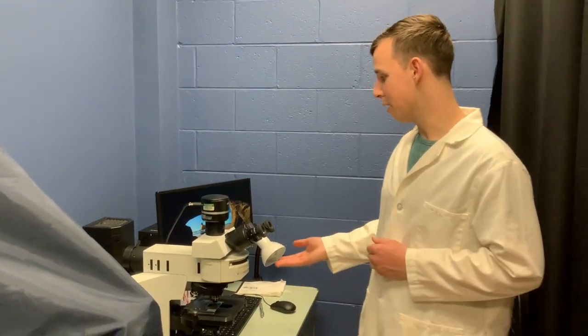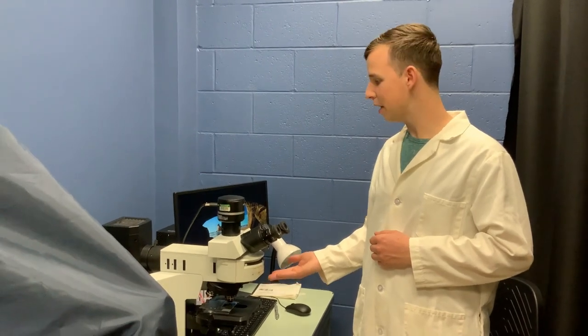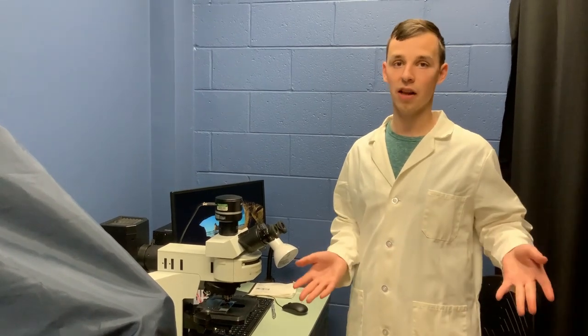We're going to talk about how to use this Olympus DX41 microscope. In this core, we typically use this microscope for anything that needs bright field, full color imaging.